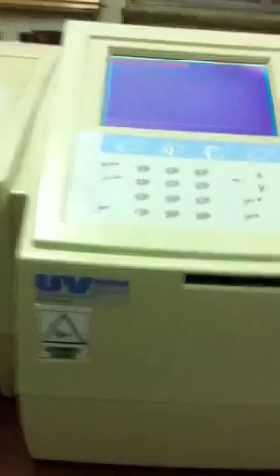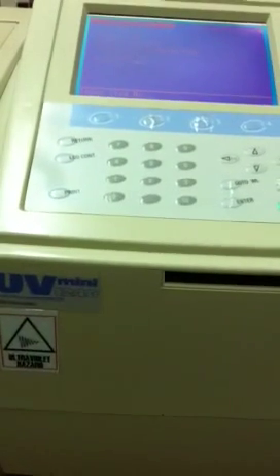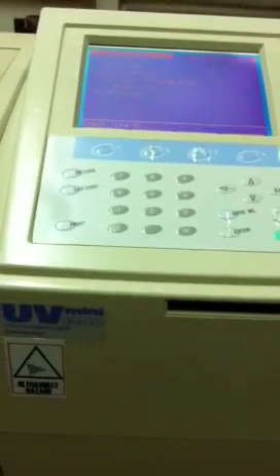The best part about this instrument is it has a full range scanning option which is you can scan your sample from 190nm to 1100nm which is the complete range. Right now let me show you the physical condition of this unit and then we can go on to the performance part of it.